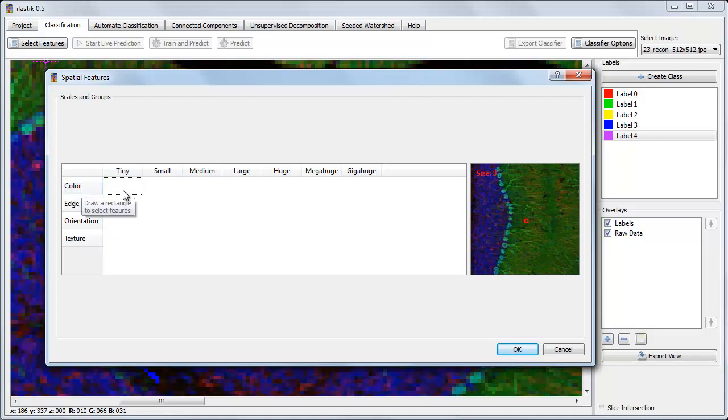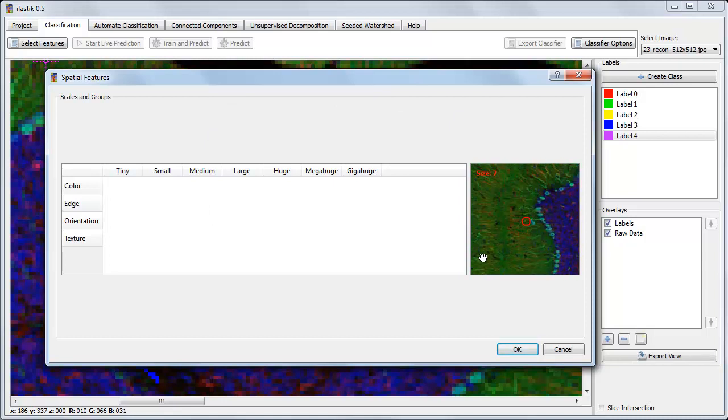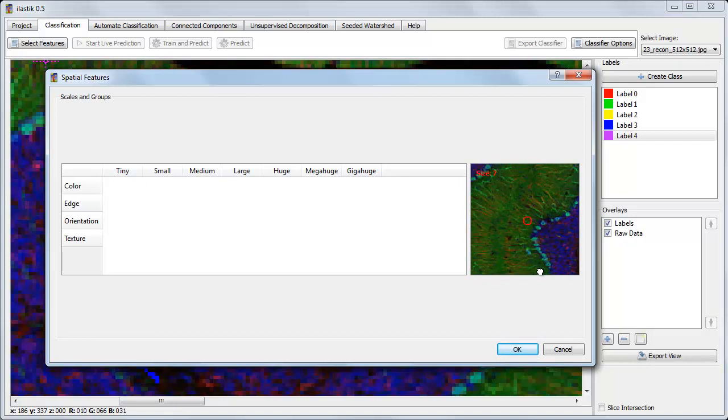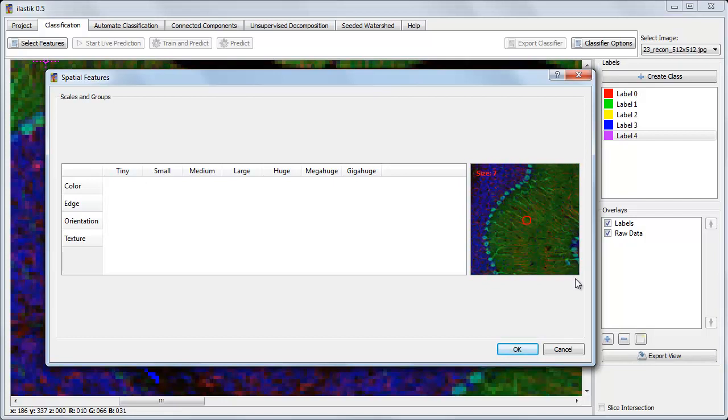When the mouse hovers over a column, for instance, here are the medium-sized features, this indicator in the preview window on the right shows how large the window around a pixel is that's used for calculating features at that pixel.